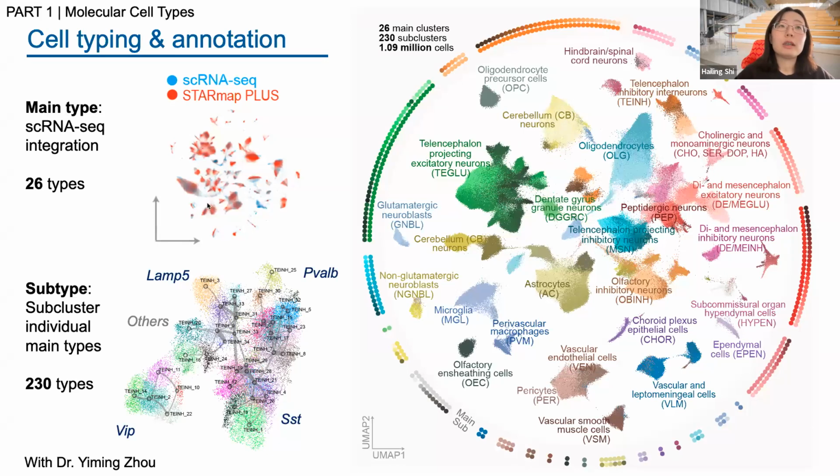Otherwise, if the transfer is not successful, we temporarily label them as NA cells, and then we later manually do sub-level clustering by looking at what the marker genes are in those cells. Oh, okay. So if we cannot transfer the annotation from the single cell RNA-seq to your spatial data, you will do that manually using the known marker genes to check whether they are expressed in your cluster. Yeah, we'll take care of them later by looking into them one by one.